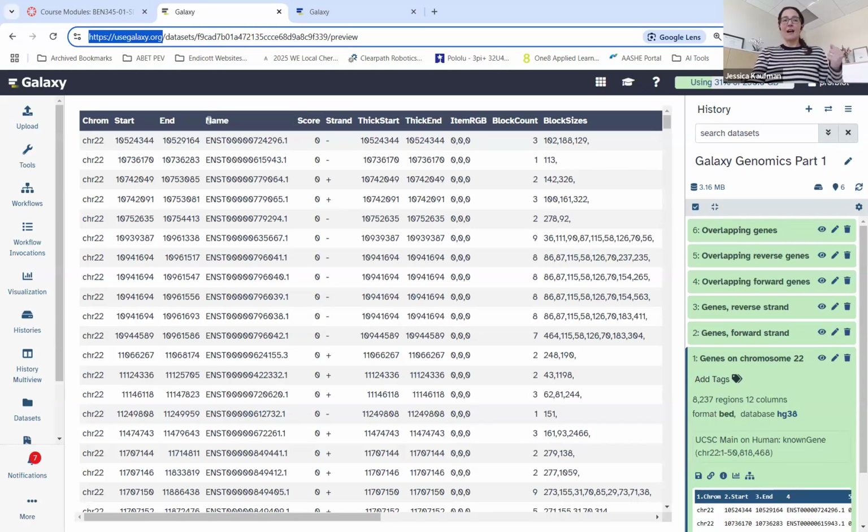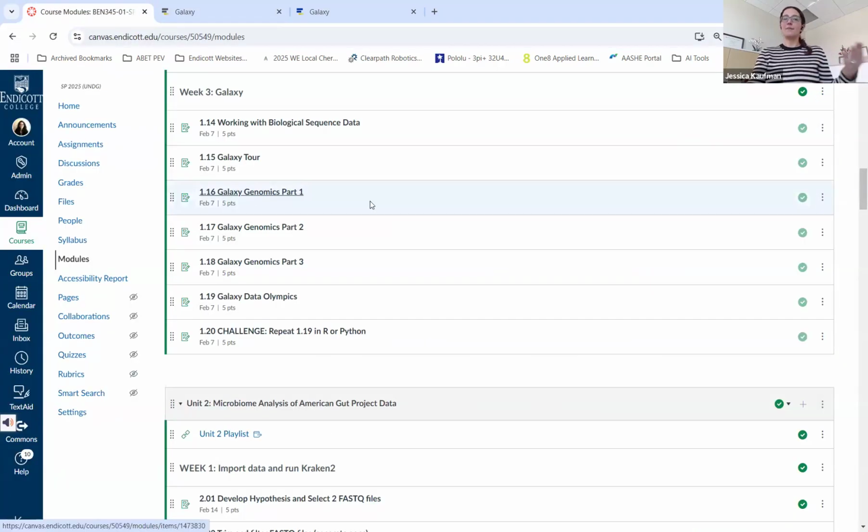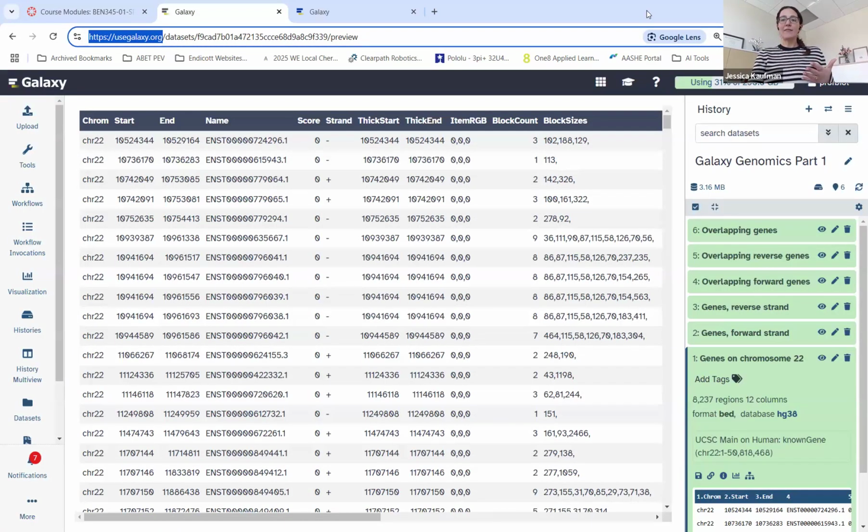Once you're in Galaxy and you're ready to get started on the training tutorial, you should be able to save your history and make changes, but you will have to make sure that you're logged in. A lot of times when people are new to this part of the course, they'll run into errors because they'll be able to load the website, but they won't be able to load a tool. Until you're logged in and you've confirmed your email address with the email that gets sent to you when you first set up the account, you won't be able to launch any applications.